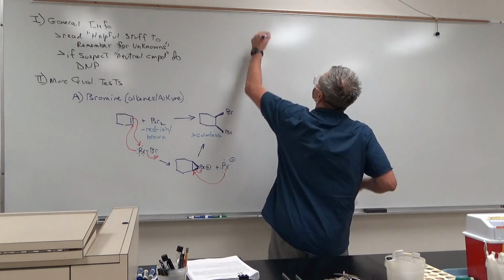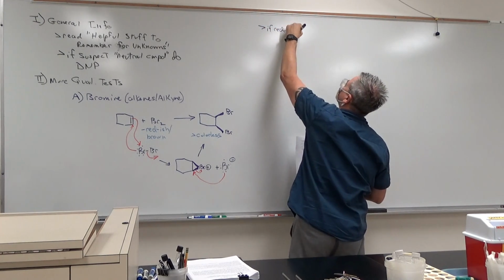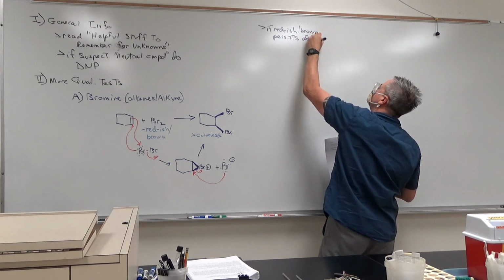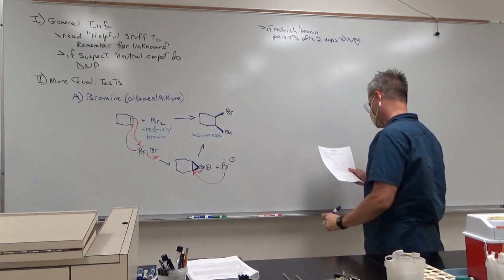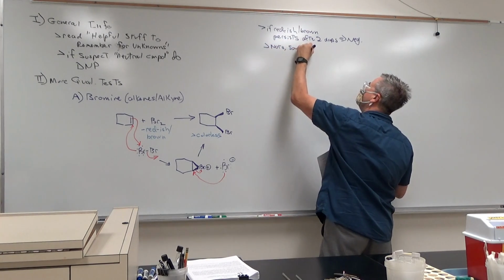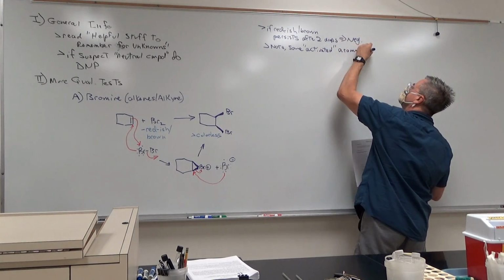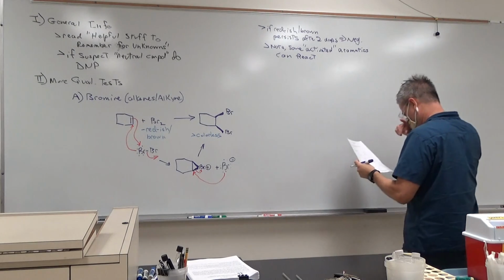Including thoughts. If the reddish brown persists after 2 drops, it's a negative test. Note that activated means it's got electron donating groups. Some aromatics can react.